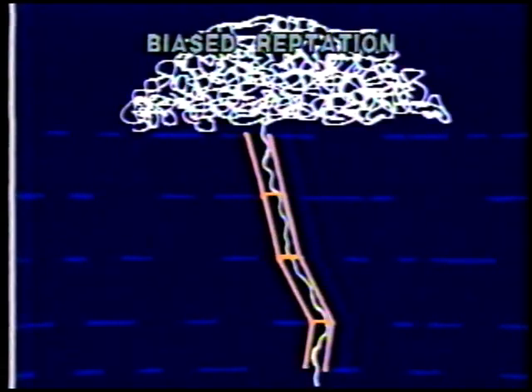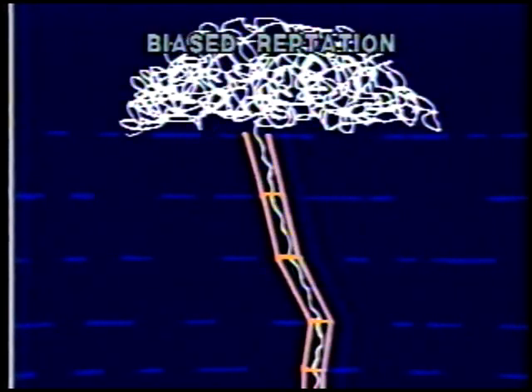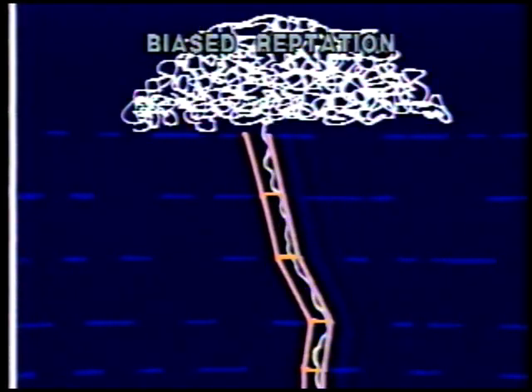The speed of such a molecule is such as to make the viscous drag on the molecule equal the electric field force. Since both the drag coefficient and the electric charge scale as the length for a shape such as this, the speed is independent of the length as per experiment. This model further assumes that the end-to-end distance remains fixed during steady-state electrophoresis. Here the scale of the cartoon is changed as though we move back and viewed a larger section of the gel so that we can see both ends of the macromolecule.